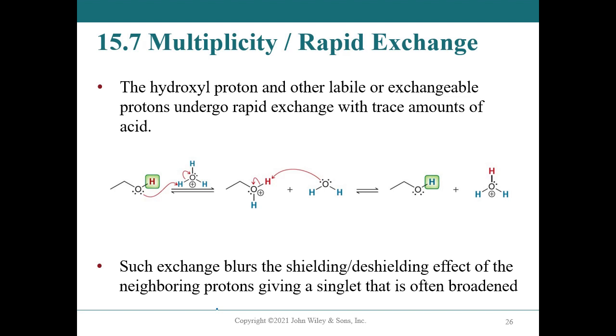I have seen splitting, not for ethanol, but for other alcohols in the past, but it's pretty rare. Usually it's a singlet, and I've tried before to get splitting to show up and was unable to do it because I was not able to get things dry enough, and then just by chance in another molecule I see it. So it does happen, but it's rare. Typically, you should not expect to see it.